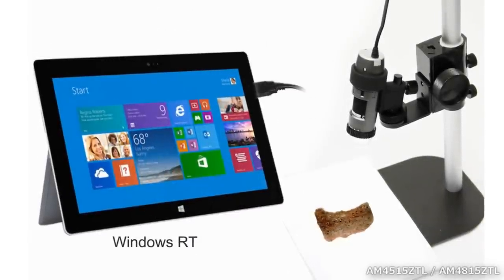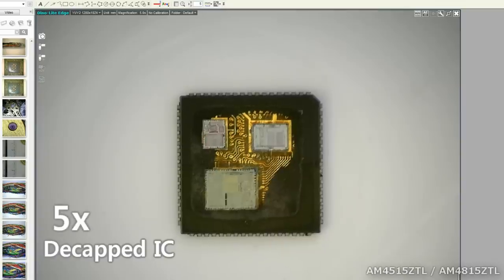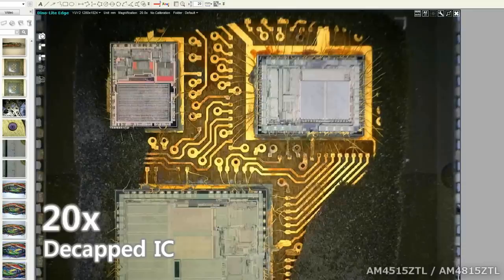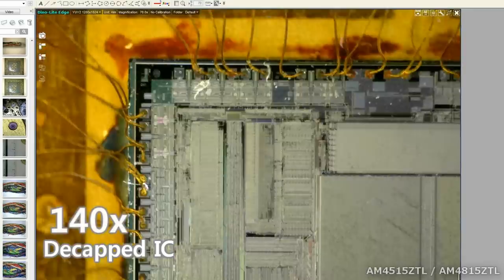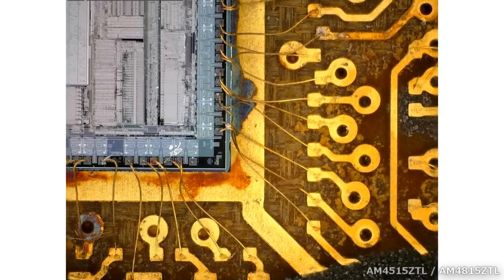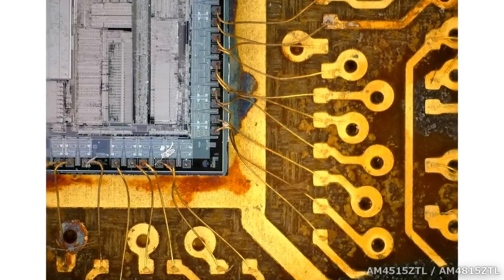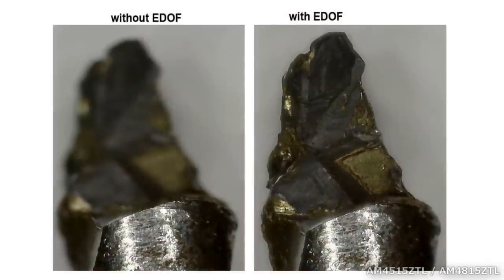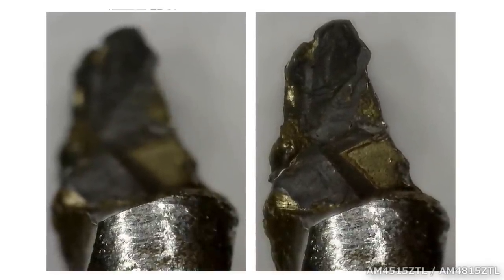These DynoLite microscope cameras are very easy to use, and offer great versatility to go from magnifications as low as 5 times up to 140 times, and adjustable anywhere in between. High quality images from these versatile and portable cameras, combined with powerful software features, make DynoLite an essential tool for all kinds of applications.